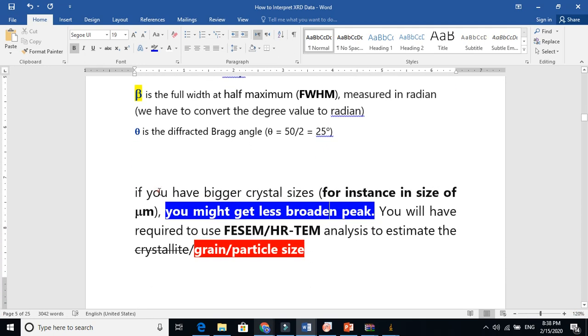If you have bigger crystal size, for instance in microns, you might get less broader peak. If we have bigger particles, big particles, you will have a sharp peak. This is how I explain, that if you decrease the size, you will get a broader peak. If you increase the size, you will get a sharper peak.